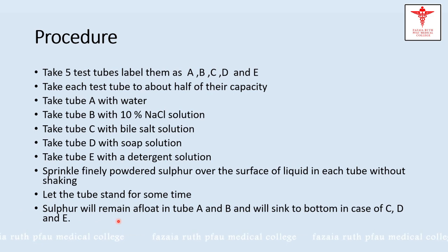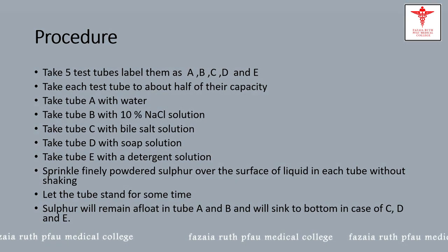Sulfur powder will remain on the surface in the test tubes containing water and sodium chloride solution because of high surface tension. In liquids containing bile salt, soap, and detergent, the sulfur powder will sink towards the bottom.